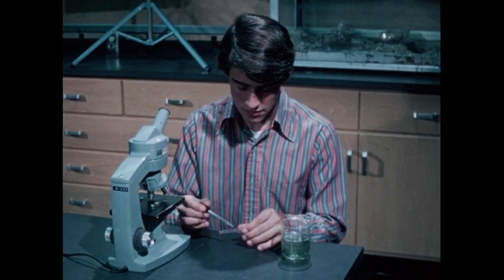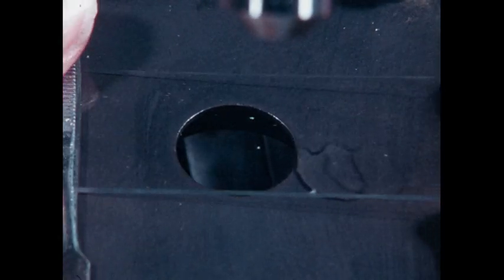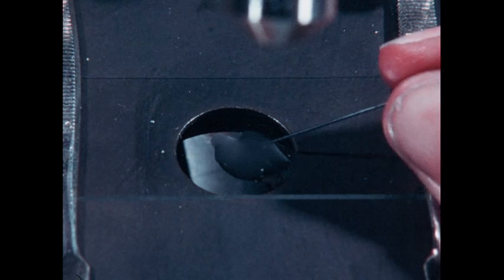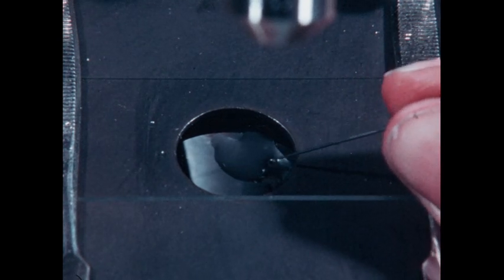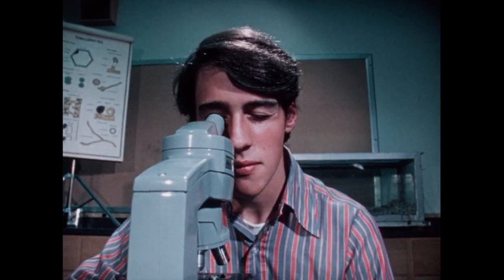The drop is a miniature world, a world that can be entered only through the microscope, which will magnify our drop many times. We can get an idea of what this means from this needle. In our everyday world, a needle is very small. But when we put it into our drop of water under the microscope, it looks immense. Here is a world in which darting animals are smaller than a needlepoint. This is the miniature world of the microscope, showing life in its simplest forms.